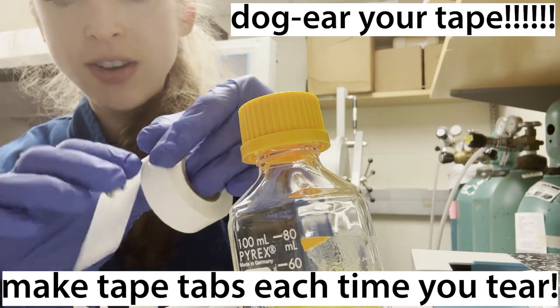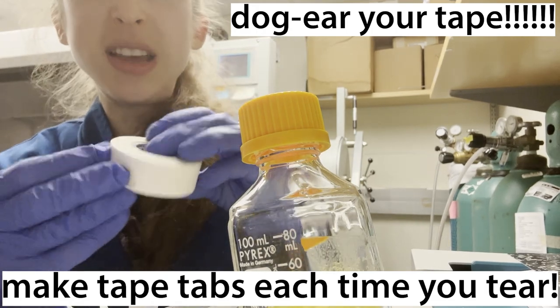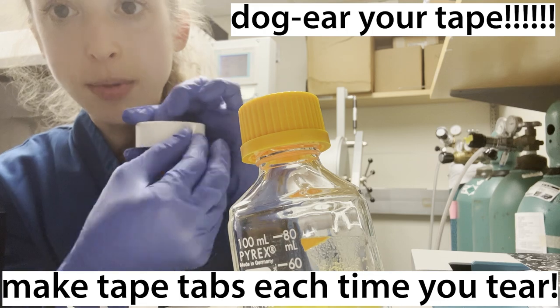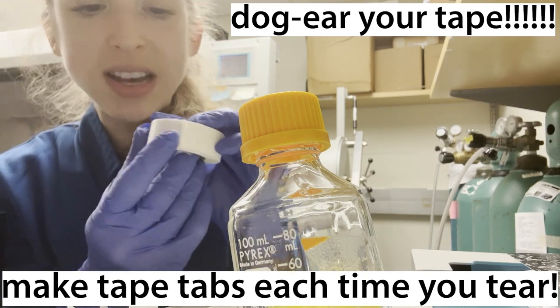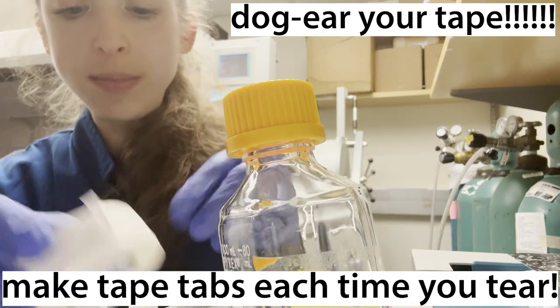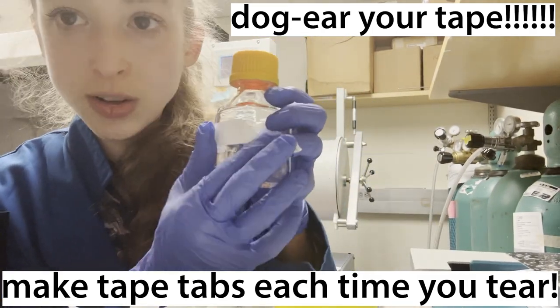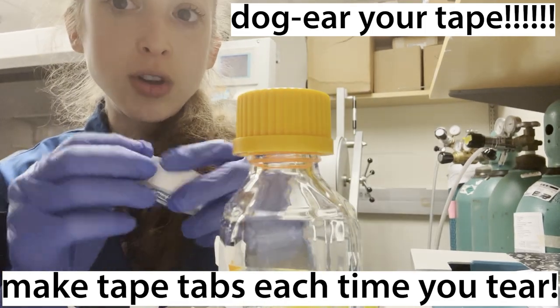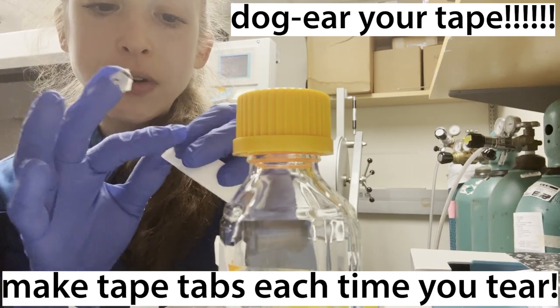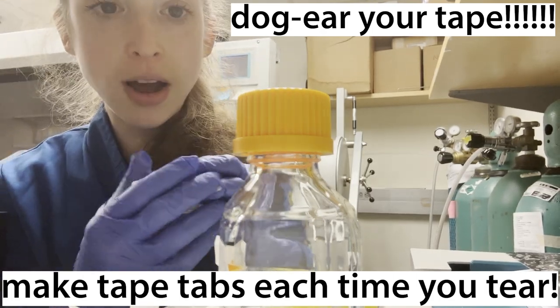I learned this particular strategy from Austin DK — he had a video online. In the past I basically just tear it off and fold the tip over, and sometimes I still do this because you get a smaller tab. Whereas if you fold it over the big way, that tab might be too big and might get in the way. But whatever you do, every time you go and take a new piece, make sure that you fold over the flap so that you have a flap to help you pull the tape off next time.